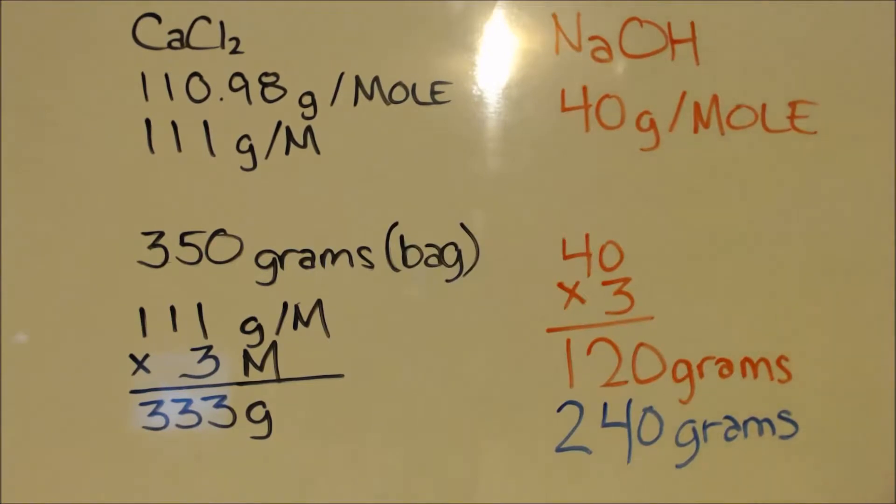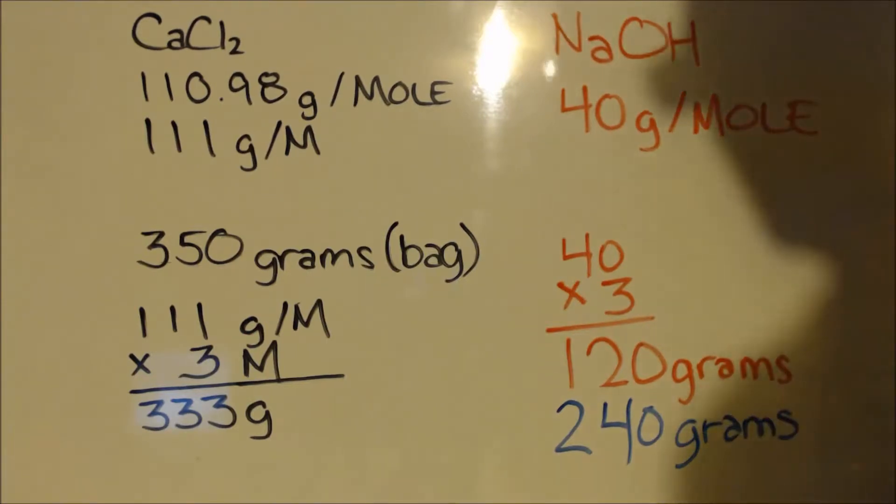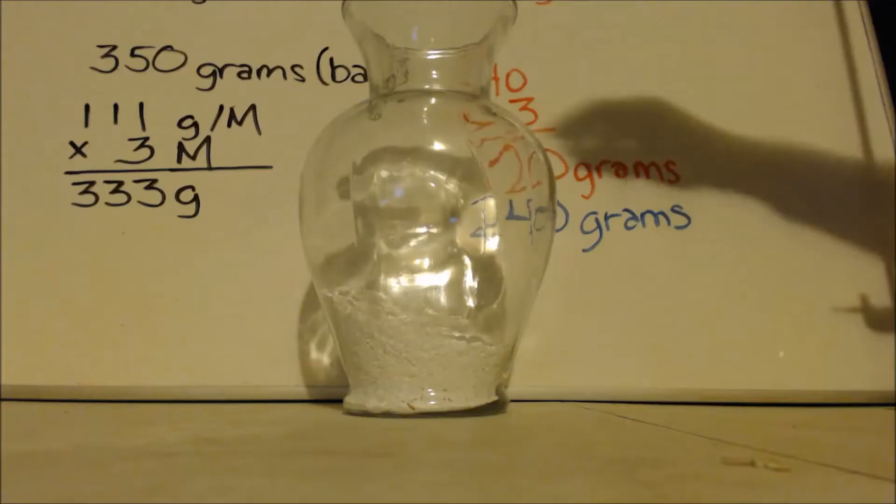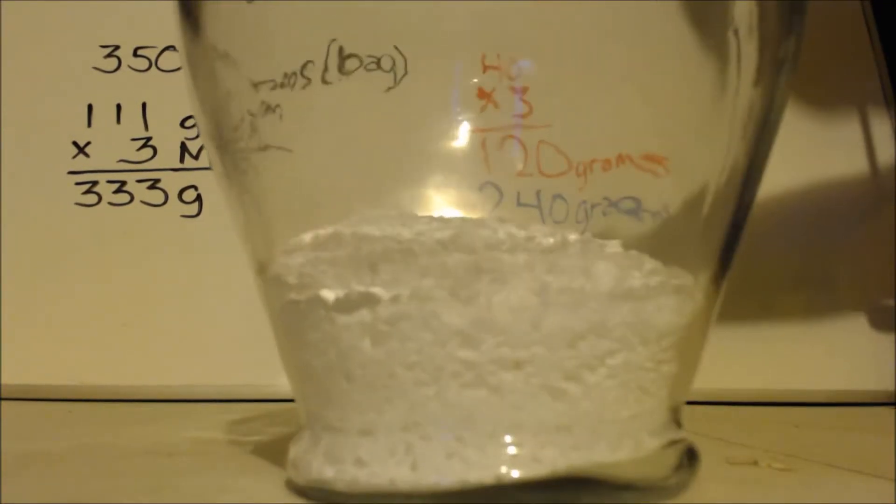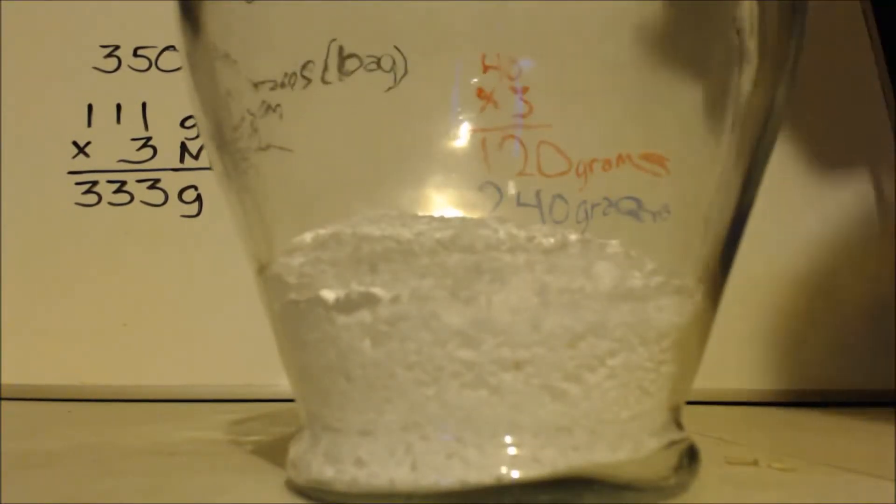But this comes out of solution when you have a basic solution, so I'm going to have to add even more than that. We'll see. Right here I got 350 grams of Damp Rid. I'll get some hot water, put it in there, and let it dissolve.